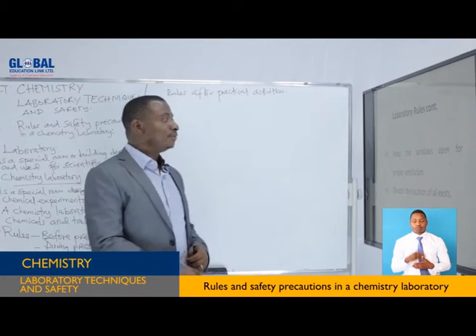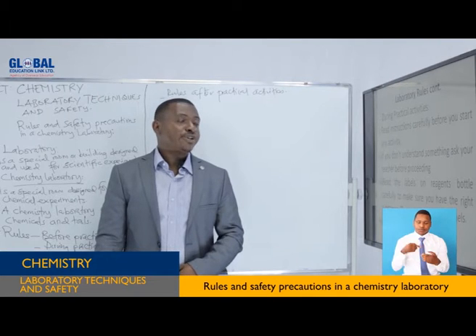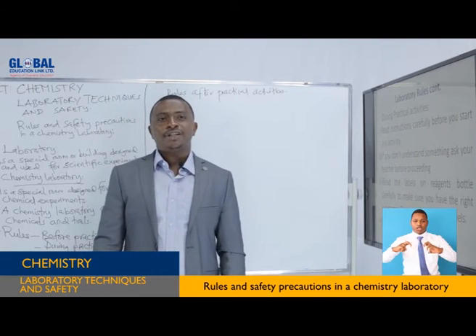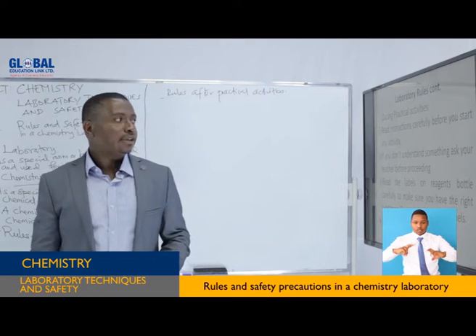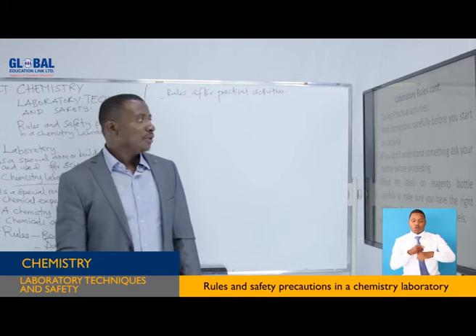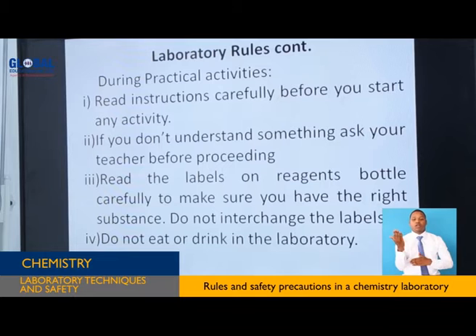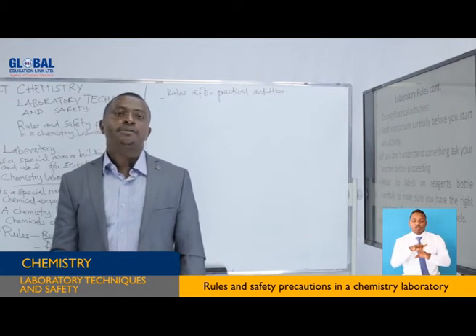I hope we're together. Now, class, let's discuss the laboratory rules during practical activities. Now you are starting your practical activity. When you start your practical activity, you need first to read instructions carefully before you start an activity. You are required to read instructions carefully before you start an activity.